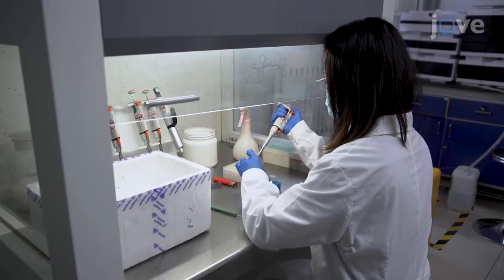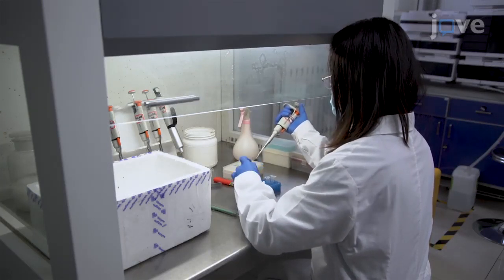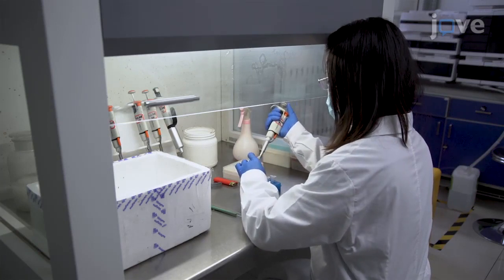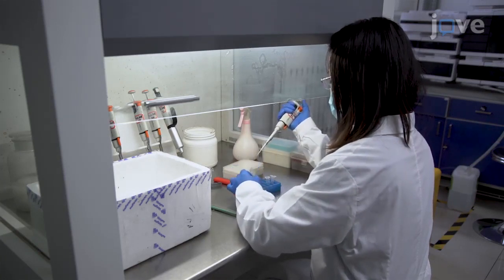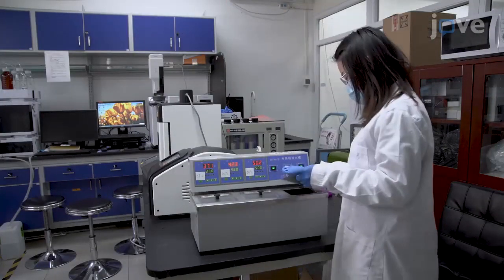To begin this procedure, add the vector and the marker fragments on ice in a molar ratio of 1:1 to 7.5 microliters of assembly mix to a total volume of 10 microliters. Incubate at 50 degrees Celsius for 1 hour.